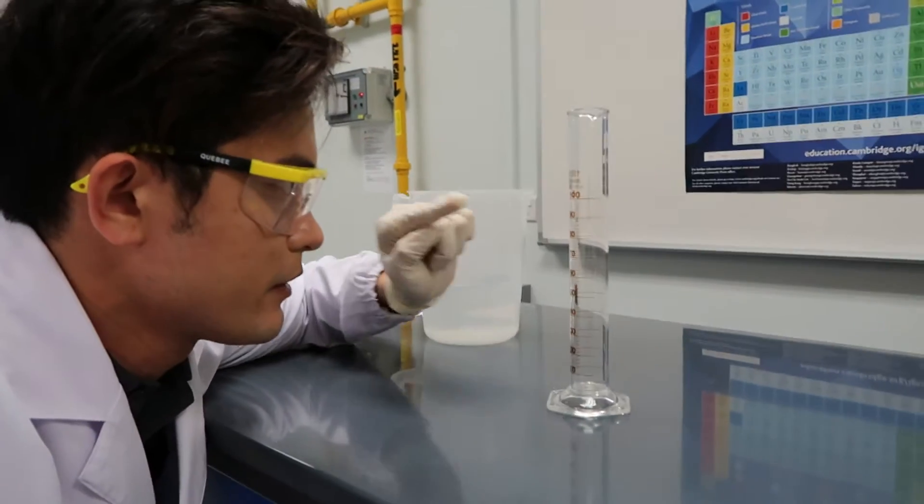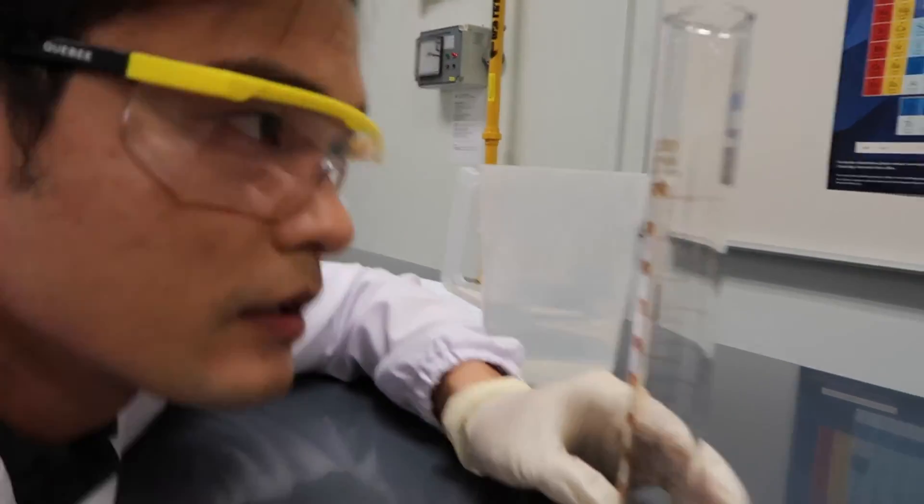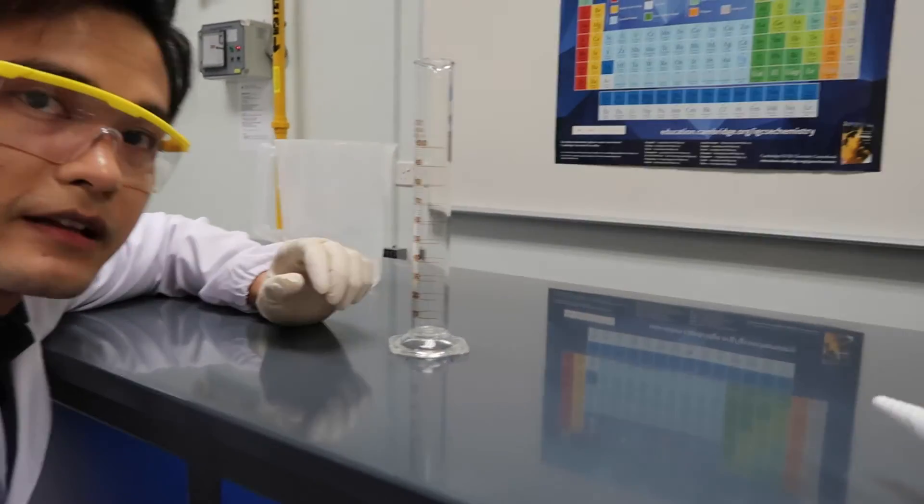For example, we want to measure 100 ml. The 100 should be aligned at eye level. See? It's 100 ml. It should be at eye level, 100 ml.